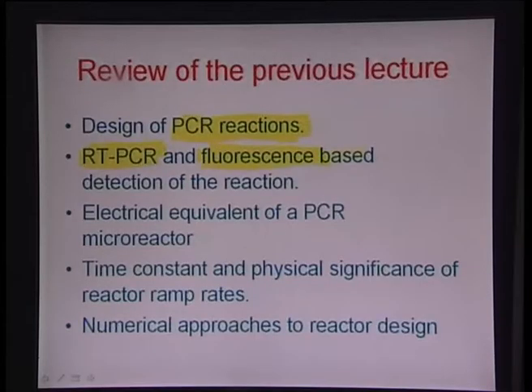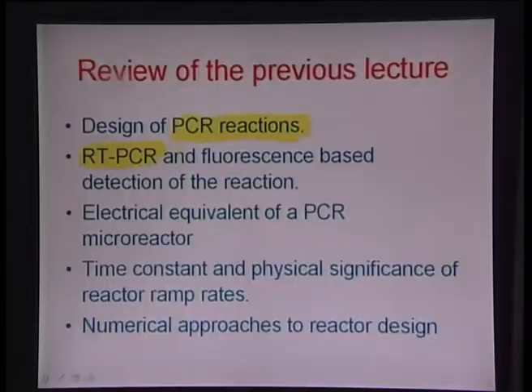It's done by using fluorescence readout methods, wherein some fluorescence dyes are used to either intercalate or are paired with some other dye molecule or quencher molecule in a manner that when the reaction proceeds, the distance between the primary fluorophore and the secondary fluorophore or the quencher changes, as a result of which there is an increase in fluorescence, and you can detect whether the reaction is being carried out successfully or not. So real time PCR really gives you an idea of the current amplification rate of a certain strand of DNA molecule as the reaction proceeds.